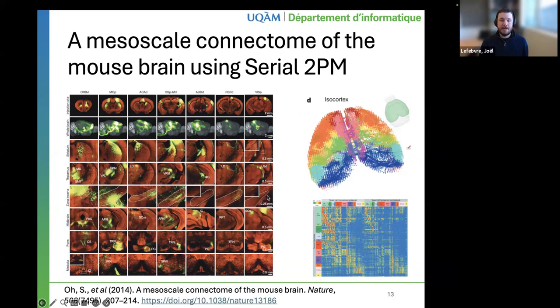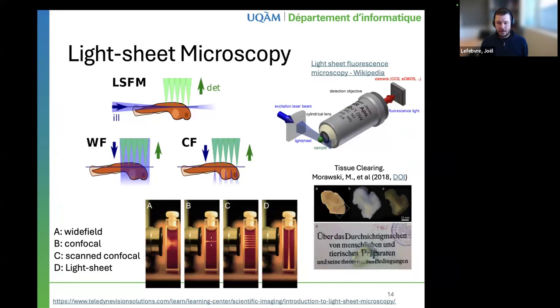So for that technique, they used serial two-photon microscopy and not confocal microscopy. Okay. The next technique I want to discuss is light sheet microscopy.